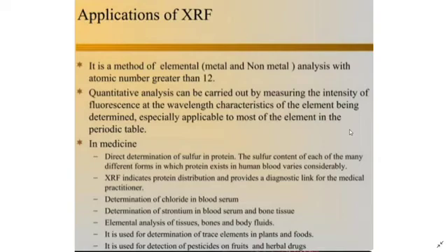Application of the XRF technique. It is a method of elemental, metal and non-metal analysis with atomic number greater than 12. Quantitative analysis can be carried out by measuring the intensity of fluorescence and wavelength characteristics of an element being determined, especially applicable to most of the elements in the periodic table, and it is also used in the medical area.